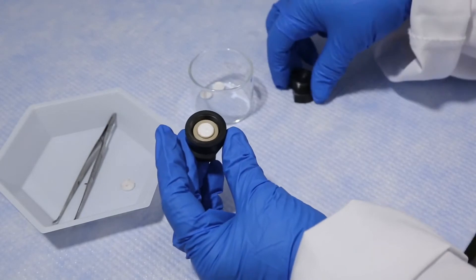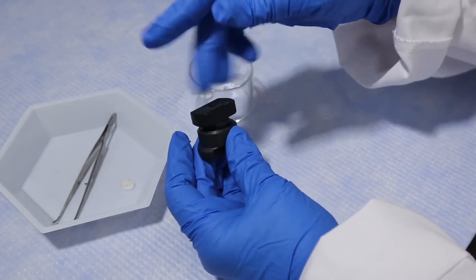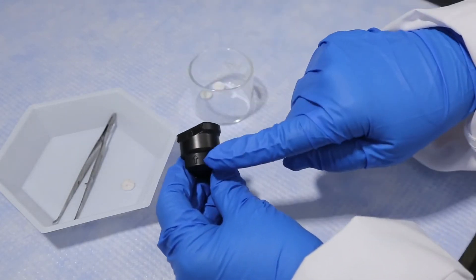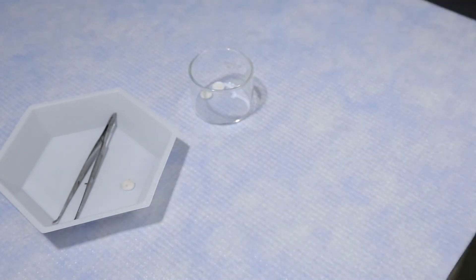Reassemble the filter housing. It is important that the filter housing is installed in the correct orientation. An arrow on the bottom portion of the housing will indicate the direction of flow.